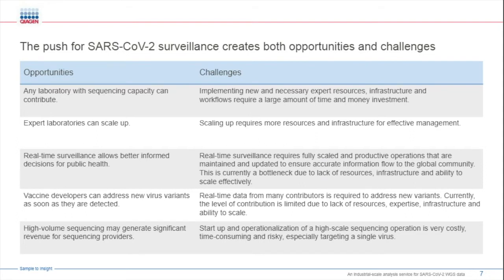So it's not just problems, there are also opportunities. This is what we're seeing, what we've heard from many of you on this call today, and in all the interviews we did before we released our solution last week. In fact, we're seeing that laboratories with extra sequencing capacity are being asked, or recruited in some cases, or applying to help with the surveillance effort. And again, surveillance in this context really means whole genome sequencing of SARS-CoV-2, usually from PCR positives.